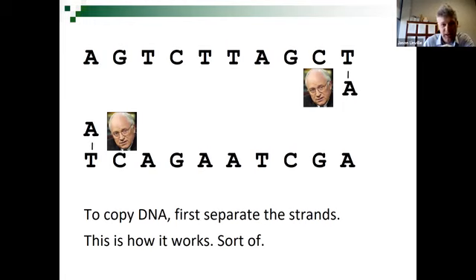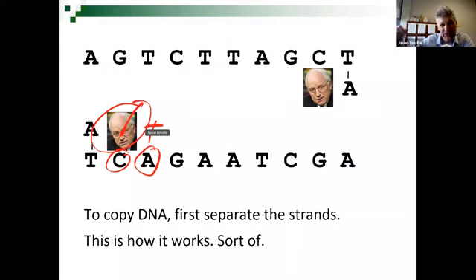Okay. And this is actually what happens on the molecular level. We have some type of polymerase. Okay, reading C, I'm going to add a G here. Oh, A, I'm going to add a T here. Okay. And you actually need single-stranded DNA to be the template. And you can imagine now it's a lot easier where this molecule can just sort of run along.